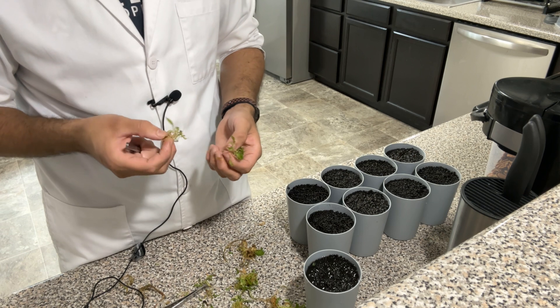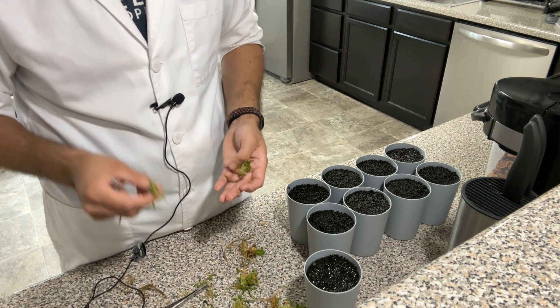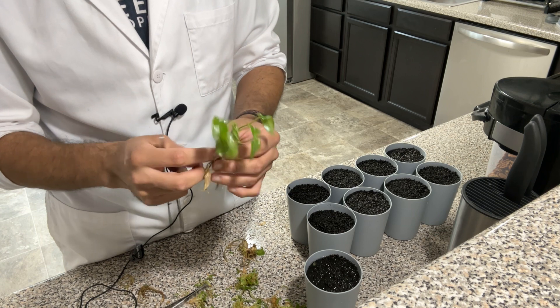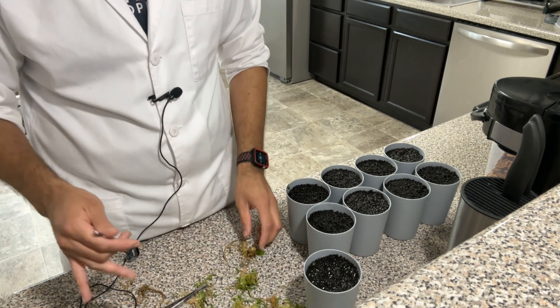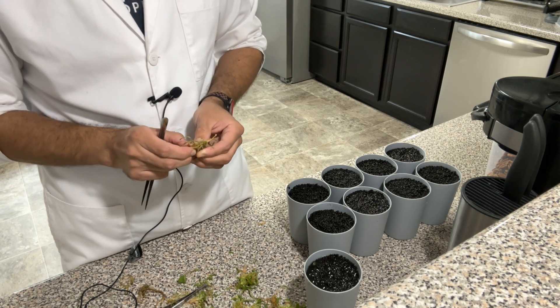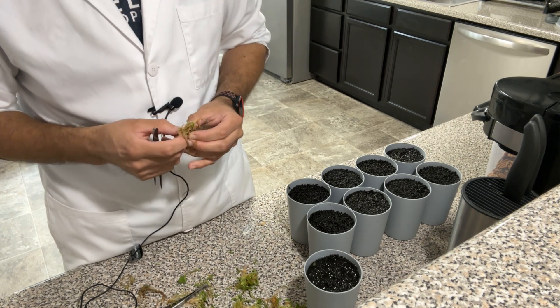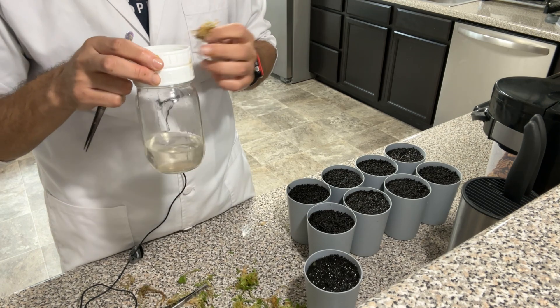The biocouplers do cost money — it's an investment for sure. But if you're working with plants like these philodendrons, and you can grow them to a decent size, you can sell each plant for more than the cost of one biocoupler. Even if the biocoupler improves your success rate by just one extra plant over traditional tissue culture, and you're working with expensive plants, it completely pays off the cost of the biocoupler itself.